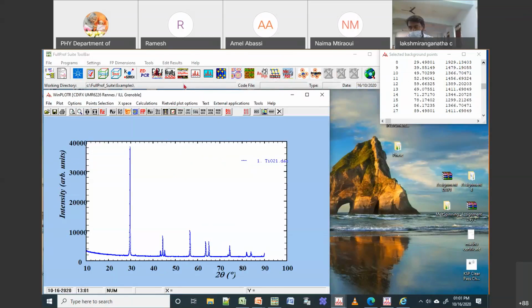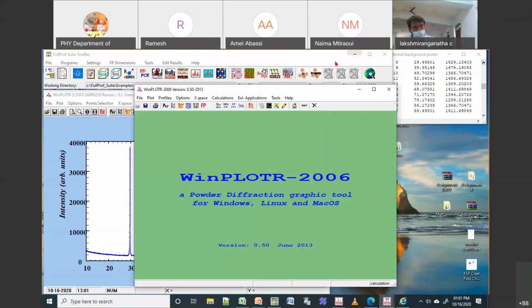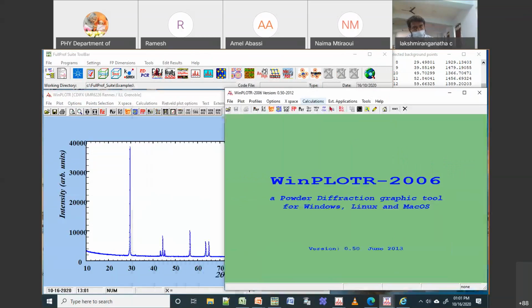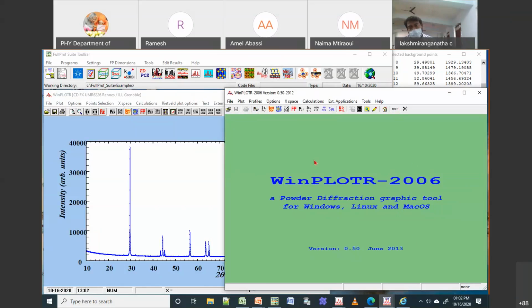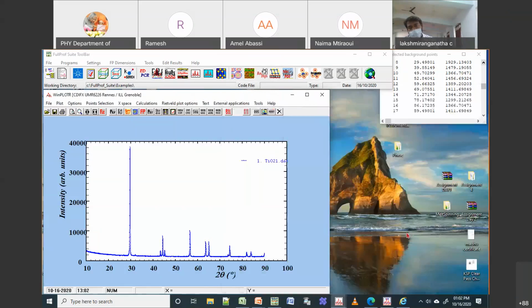So one use is you can have it in 3D form. If you have any kind of transitions, it is easy to see how the transition is occurring. This can also be used in your publications. You can show 3D maps in your publication. For that, we are going to use this old version. That version is not available in the new one, so that is why they are still keeping this older one. I will show that example some other time.